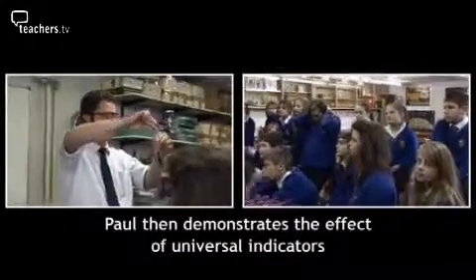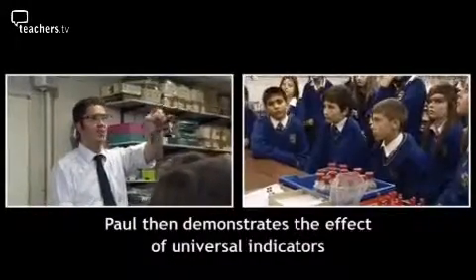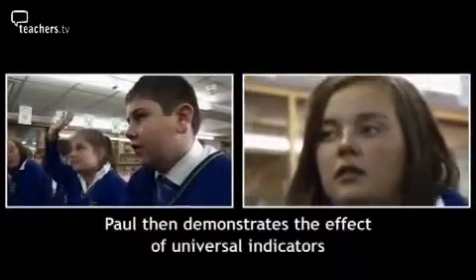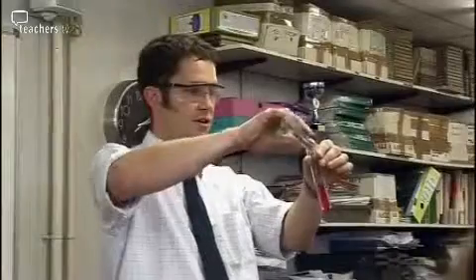If I pour it into this test tube though, it changes colour again. What colour is it this time, the young man at the back there? Is it an alkali? It's an alkali. Now how do you know it's an alkali? Because it's like a purple. OK, it's gone pink this time.